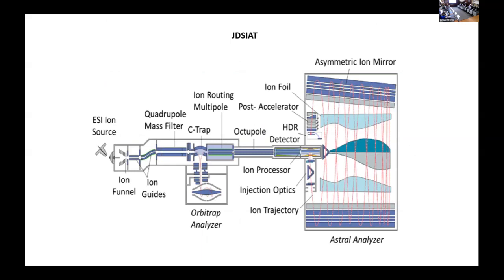So this is an instrument diagram of the Astral. And it's my acronym at the top. Anybody guess my... I'm acronym guy today.